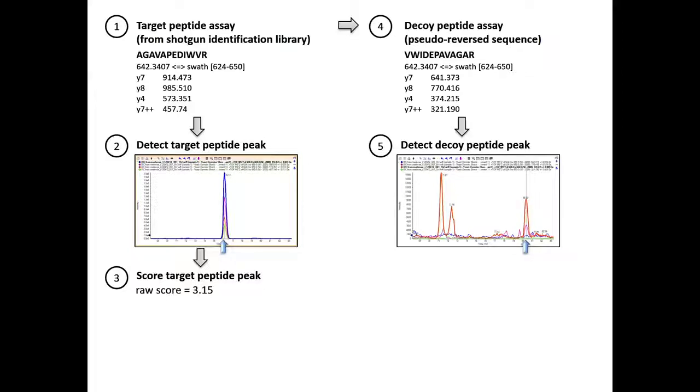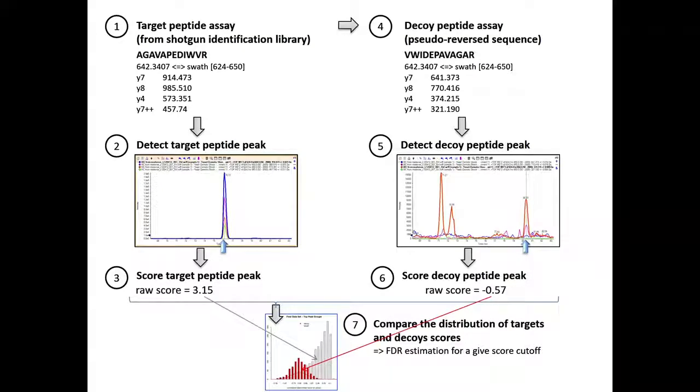And then the question is this: when you send this to the software, it will just try to find the best scoring peak, and it will also output a score for that best scoring peak, because it doesn't know whether that's a decoy or a target peptide. Basically what you get from here is the score of the best scoring peak in that picture. And the score is of course lower in this case than in this. The target peptides will tend to be in the high scoring range, and the decoy peptides will tend to go in the low scoring range, etc.